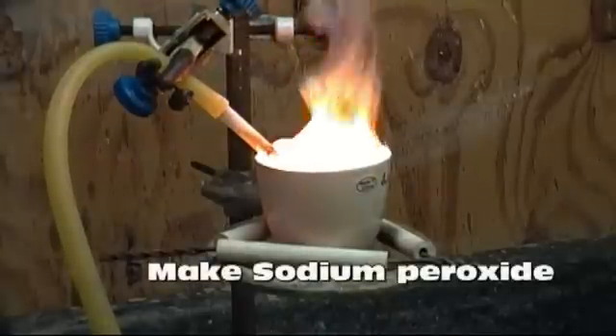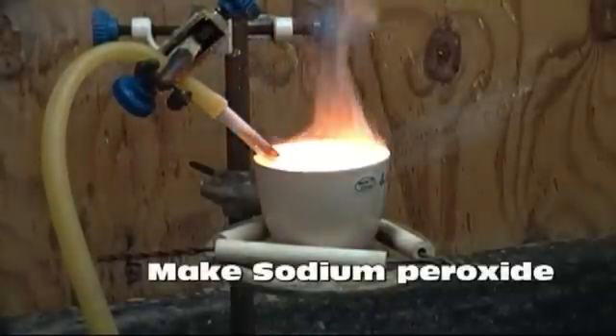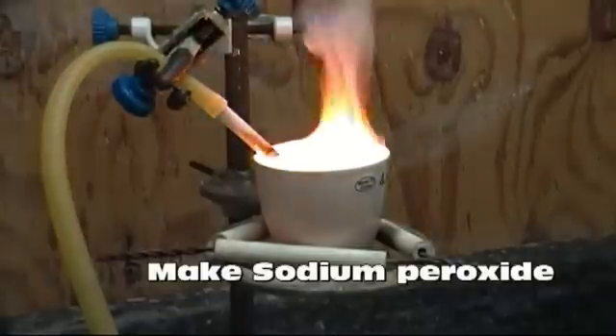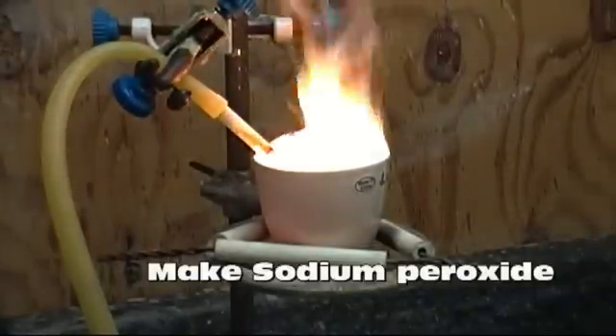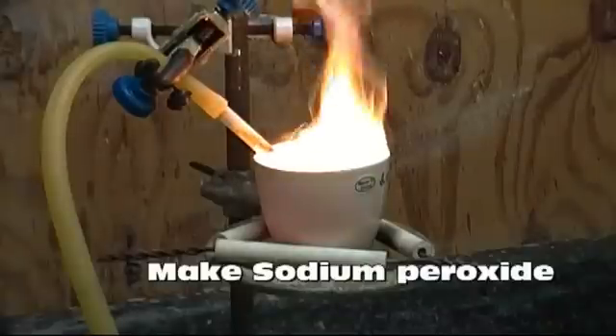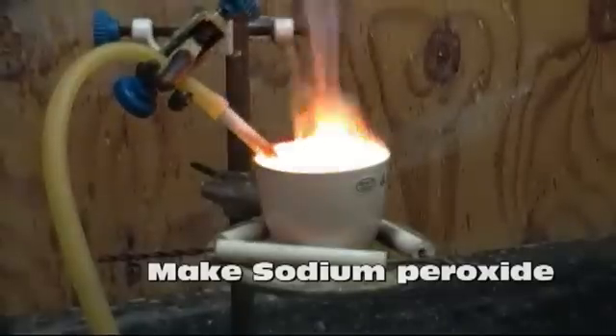Hello again everyone. In this video, I'll be making sodium peroxide for use in an upcoming video. This reaction can be extremely hazardous. Sodium metal is itself dangerous, and molten sputtering sodium metal is extremely dangerous. This experiment should only be performed by a trained chemist.